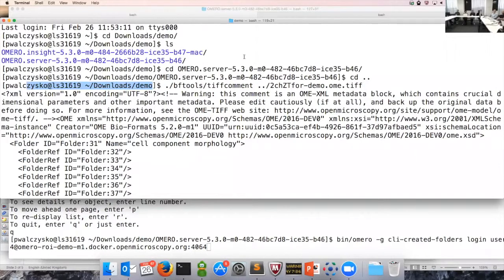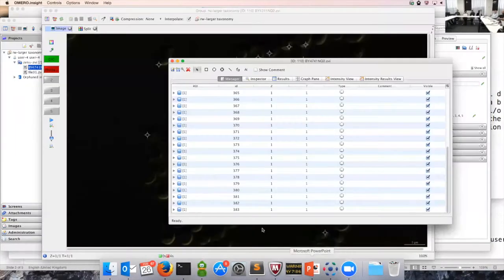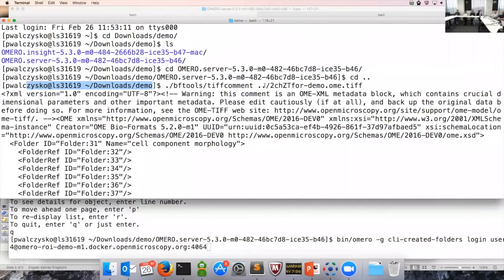I just said you will have an image which you exported from OMERO. So imagine this would be an image like this with some regions. It's another one, but this is also the beauty of that. It actually doesn't matter which one you will use in the workflow, which is highlighted here. The main thing is that it has at least one region of interest. If you have such an image, you exported it from OMERO as OME-TIFF with this region of interest written in the header, you will do this. I will not do that in front of you because you can see what the output is.